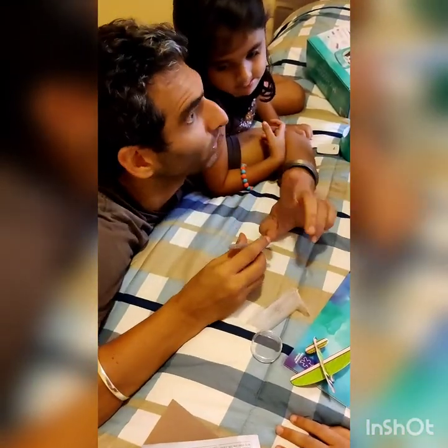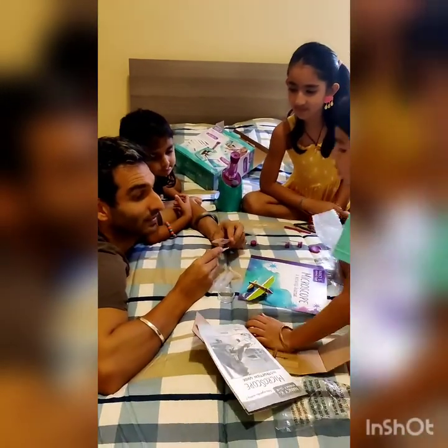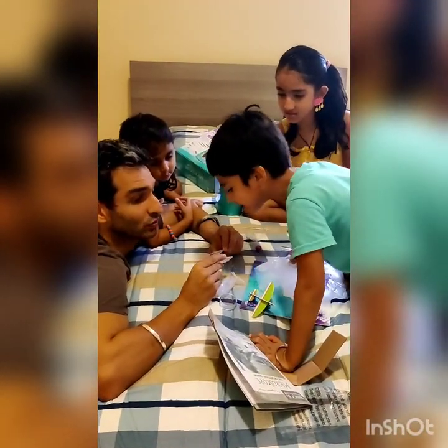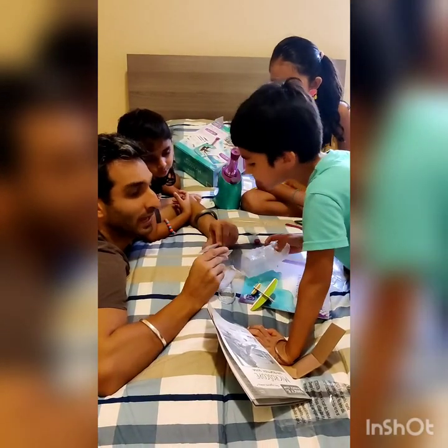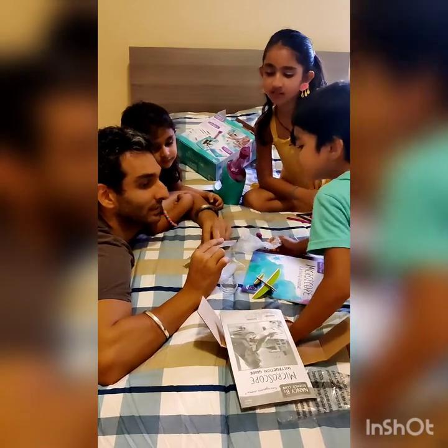Peacock feather. Goldfish. Scales of a goldfish. Stoma. I don't know what that is. And wool. They've taken wool and they've done it. So it has to look like this. So you can see this under a microscope.